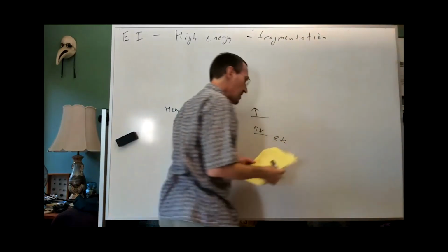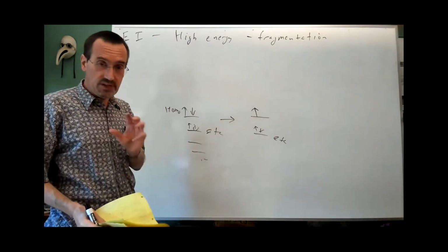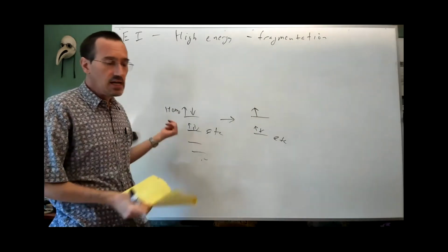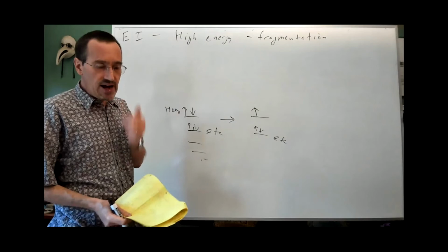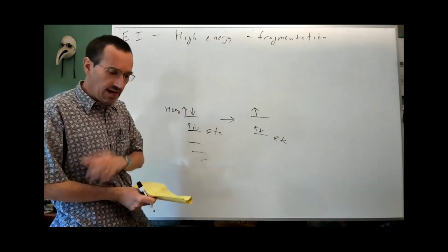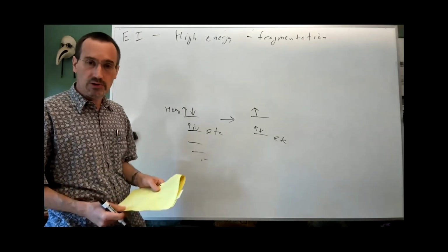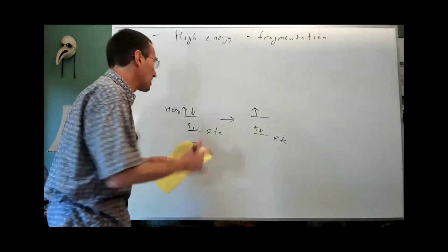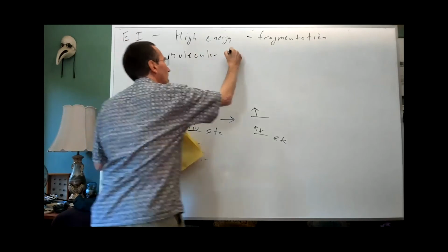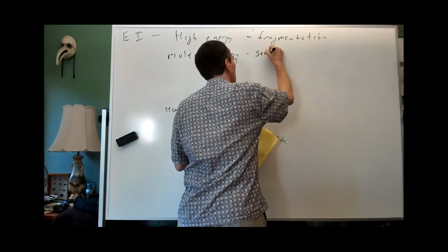which can be very powerful in the sense that, and we'll use this in a couple of examples with ketones and other molecules. I think you'll get a fragmentation of a ketone where you'll figure out the structure in the homework. And I think you'll get a McLafferty rearrangement in the homework where you'll again use it to figure out the structure. But it can be confusing because sometimes the molecular ion is not seen.